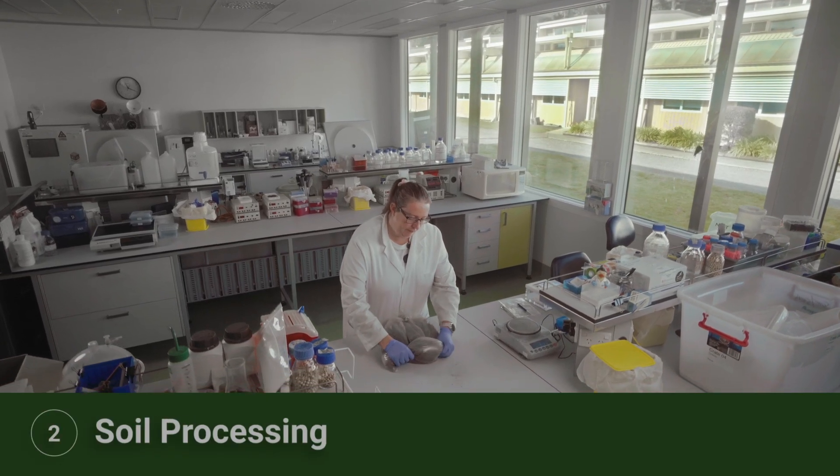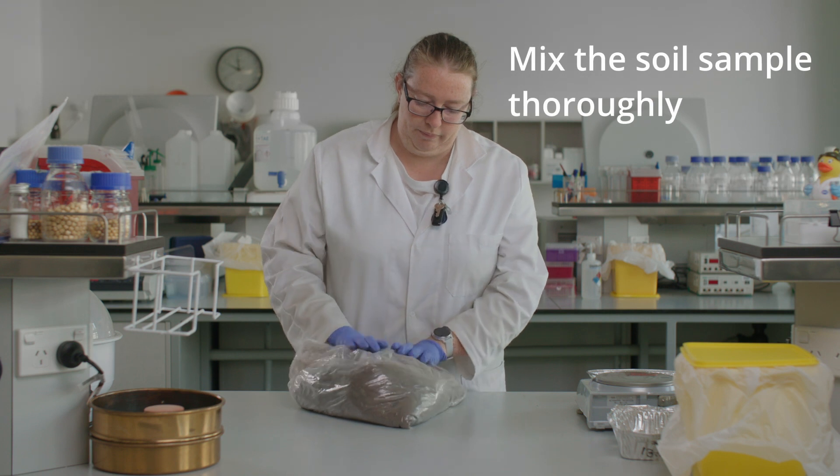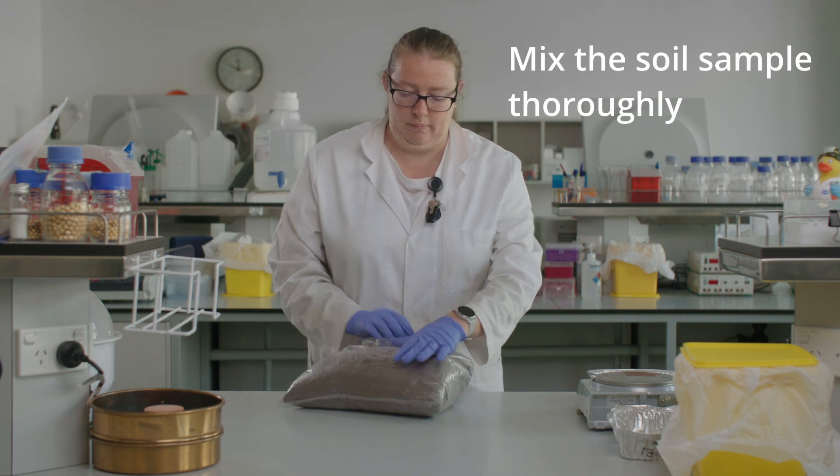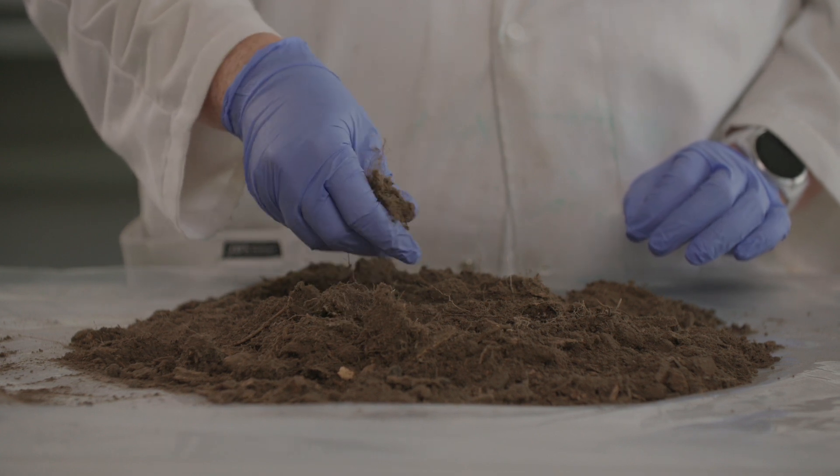This video outlines how to process soil samples ready for chemical analyses. First, the soil must be thoroughly mixed to obtain a homogenous sample. Remove any large roots, coarse woody debris or stones from the sample.